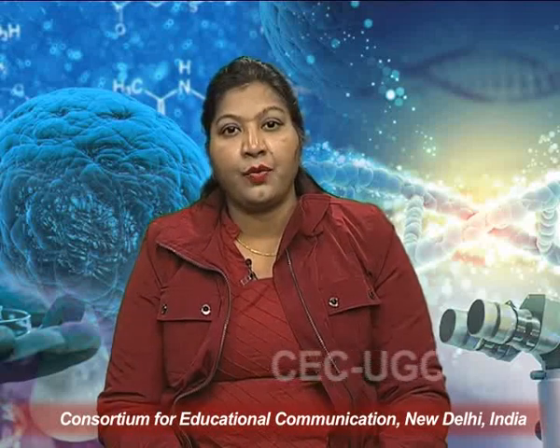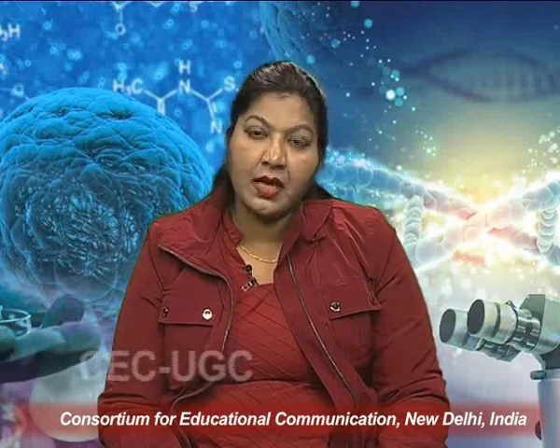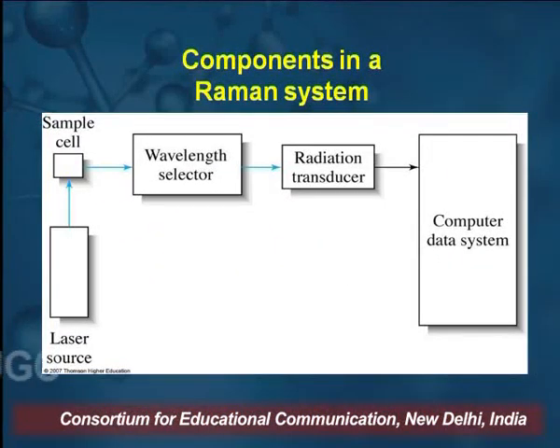The next part is the instrumentation of Raman spectroscopy, or what are the most important parts in the Raman spectrophotometer. Here, this is the schematic diagram of the Raman system. On the left hand side, we see the laser source, then we have a sample cell, then the wavelength selector. It means we take the particular wavelength output by using the filter. Then the radiation transducer, which works as a detector also. Last is the computer, which is a display unit that contains all the records and the output, or the Raman spectrum.